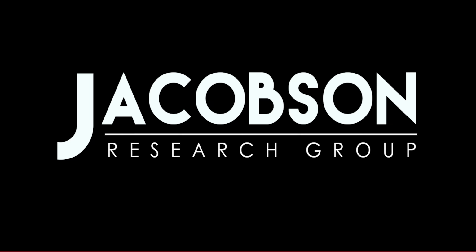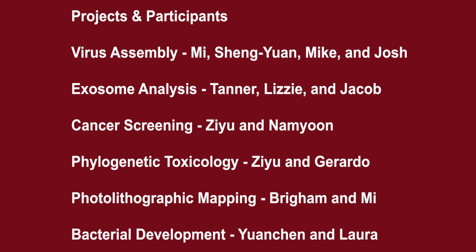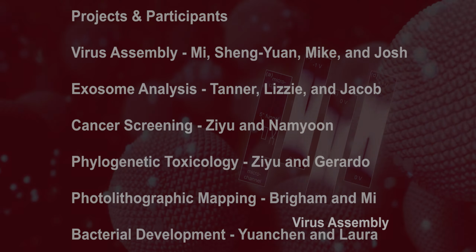Research activities in the Jacobson Group range from instrumentation development in fundamental studies of micro and nanofluidics, charge transport, and optofluidics, to biological assays, including virus assembly, bacterial development, cancer diagnostics, and phylogenetic toxicology. Group members will now give a brief overview of their projects.